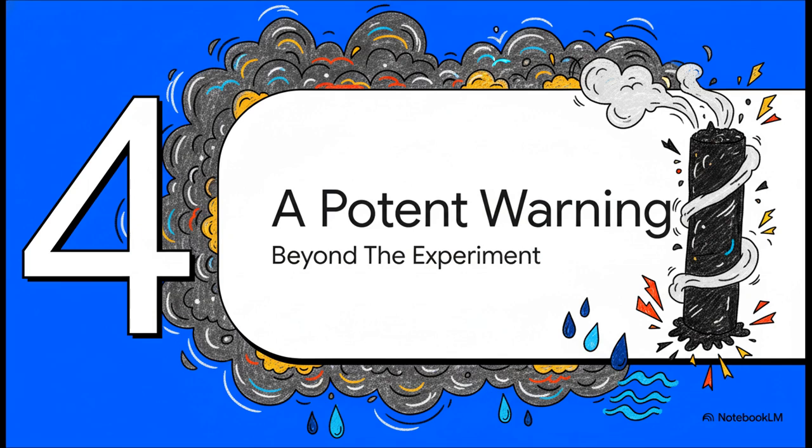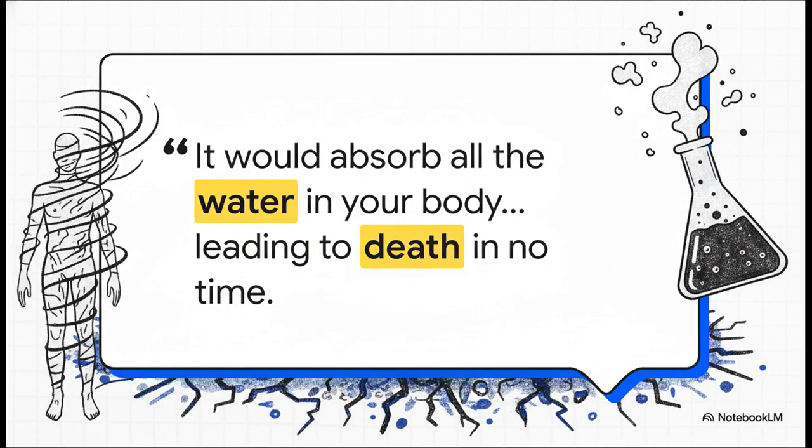This whole dehydrating thing isn't just some cool lab trick. And here is the really crucial part. What sulfuric acid does to sugar, it will do to any material that's made mostly of water. And that includes us. So this isn't just a spectacle. It's a stark visual demonstration of how incredibly dangerous this chemical is.